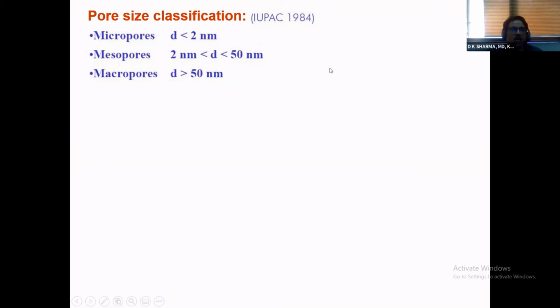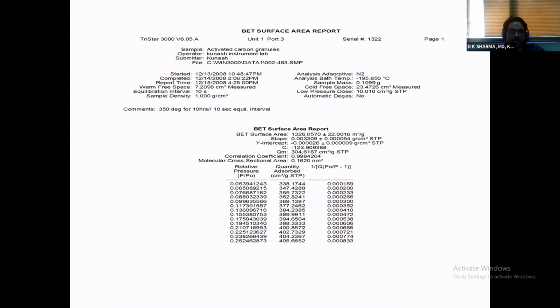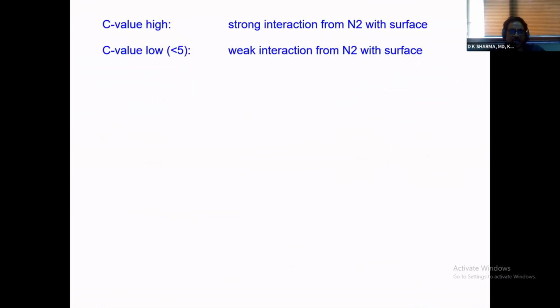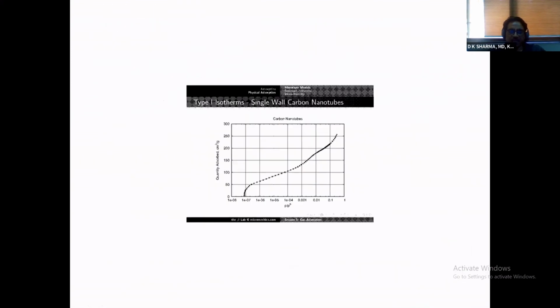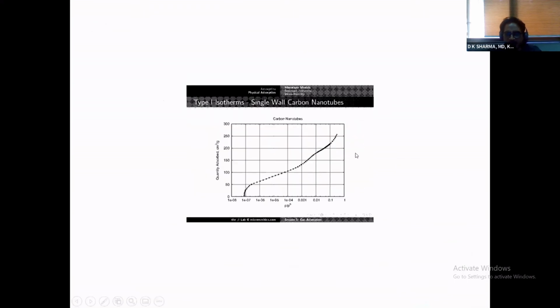Now, if your samples are microporous, you need slightly different hardware in your instruments. Let me go here. This is a microporous sample.